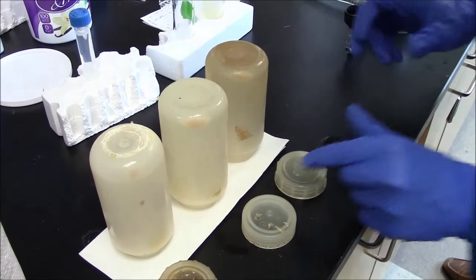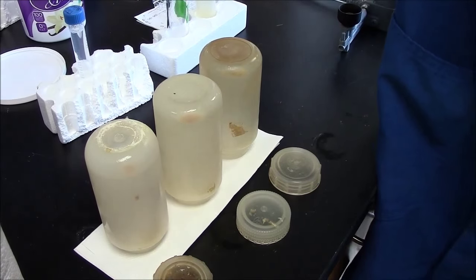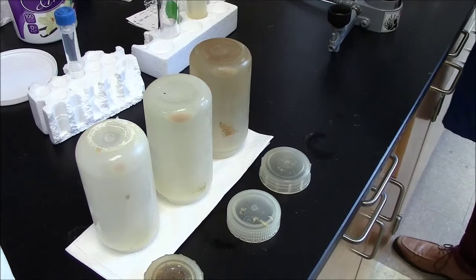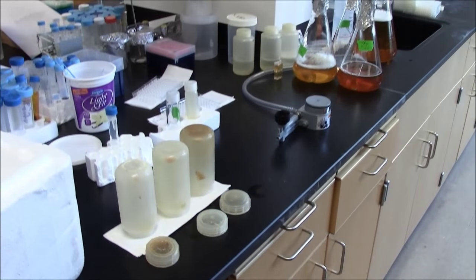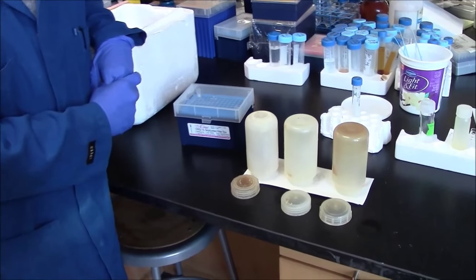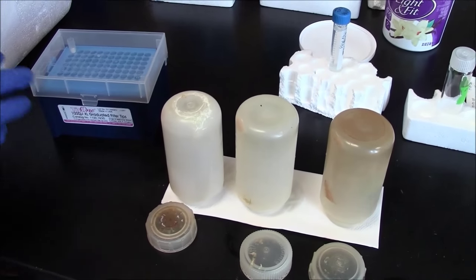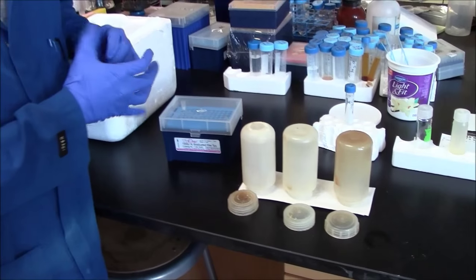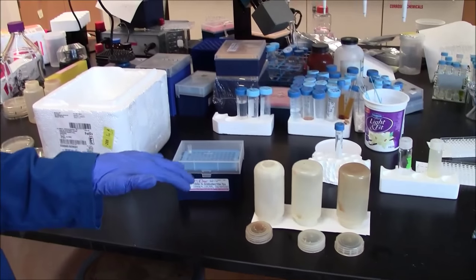Color is something to look for. The whiter the pellet, the better. Yellow or brown contamination would be coming from the bacteria themselves, not the actual phage. In ACR, this would be as far as we go. It's a single precipitation phage purification. If you needed a purer prep, you could do a double precipitation, repeating these procedures again.